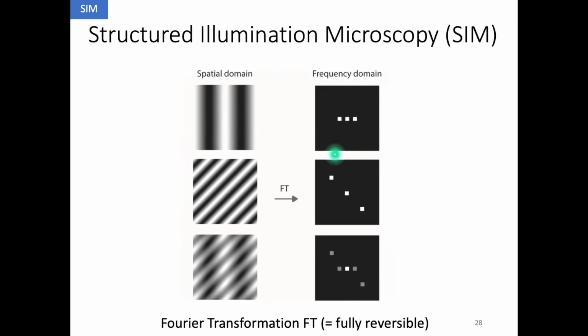It's hard to believe, maybe, that this image has the same information content as this one. If I do an inverse Fourier transformation of this image, I will get this one back. Here you see, for example, if I put diagonal lines, I will get this. If I overlap these two patterns, the Fourier transformation will give you this. What's important in the Fourier transformation is that the center is where the lowest frequency information is stored, and as you go outwards, the frequency changes.